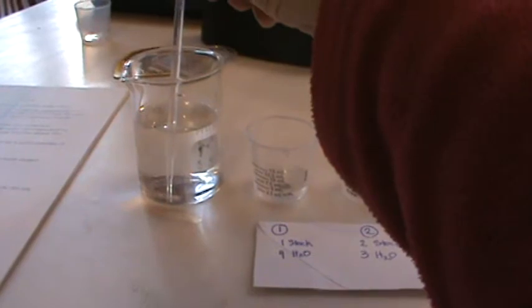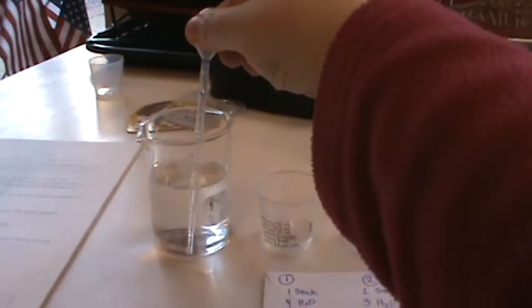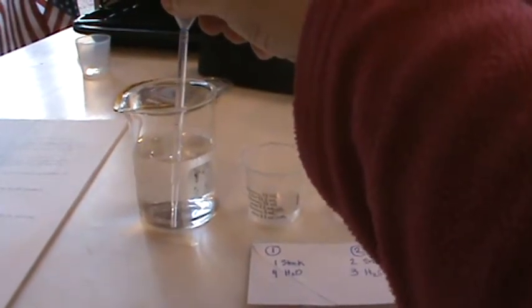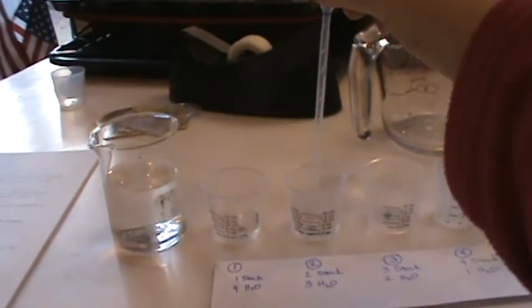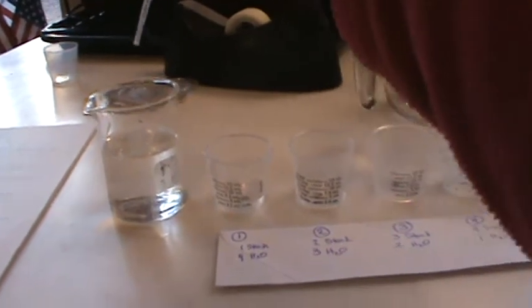Okay. Now in our second container, we're going to put in 3, 1, 2, 3. All right, and you'll notice in the lab, it says we're going to do a series of dilutions, and I actually want you to explain what we're doing here because dilution chemistry is very important.